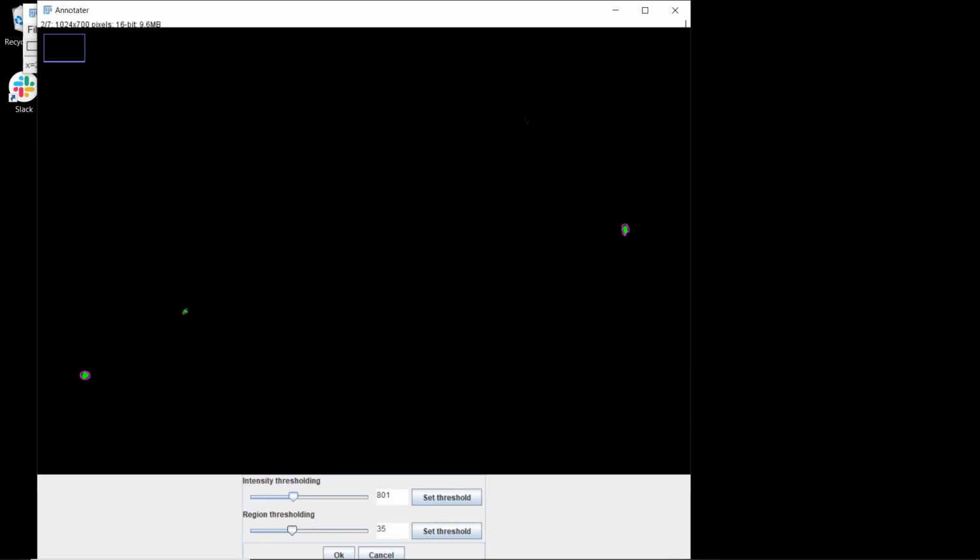The pixels that are above the threshold appear green, while the other ones just show their real intensity. And you see, if I decrease it low enough, then this nucleus is also positive. If I go very, very low, now you see you have pixels in the background corresponding to noise that are above the threshold.